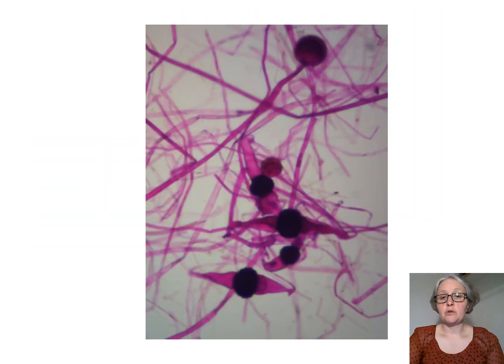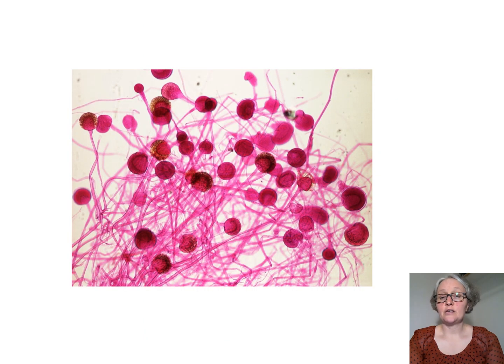The next organism that we looked at was a fungus, Rhizopus. So again, you should be able to recognize it's a eukaryote. It's a fungus, specifically Rhizopus. And we saw these structures that again have internal membrane-bound organelles. Here's another picture of that same fungus.